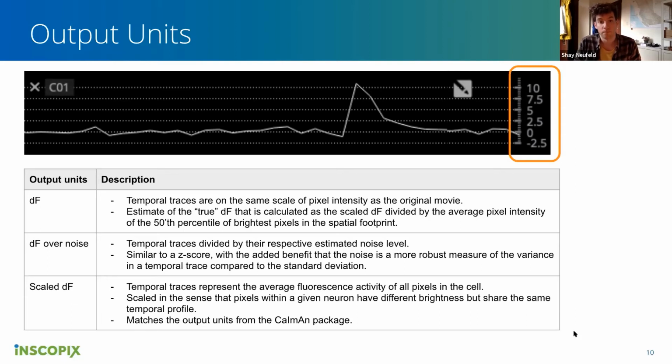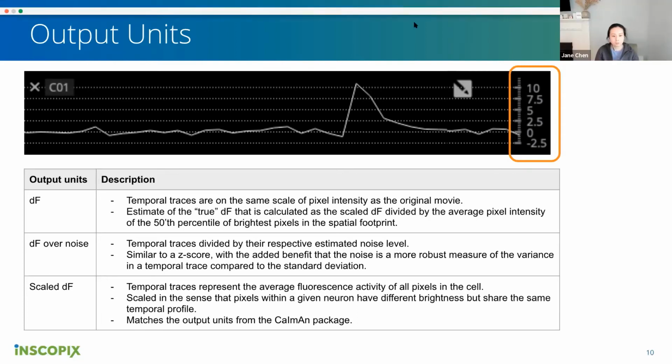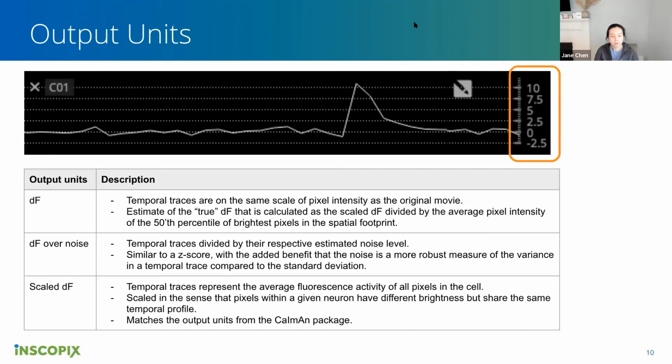I have a general analysis question. Imagine a lot of customers are imaging, let's say, a 10-minute session, but there is some stimulus that comes in the middle, 5 minutes in, and really what they're looking at is the activity maybe 1 minute prior to that stimulus and 1 minute after.